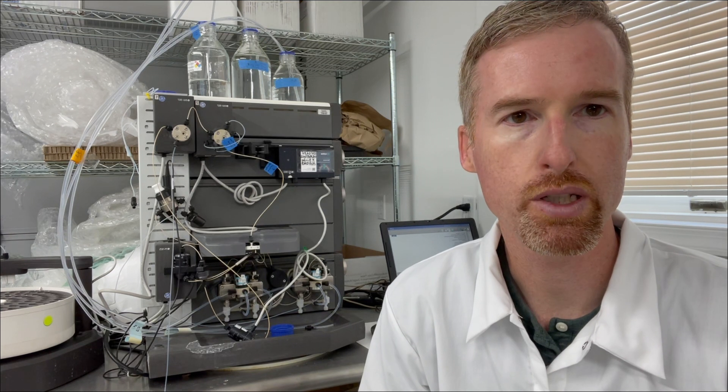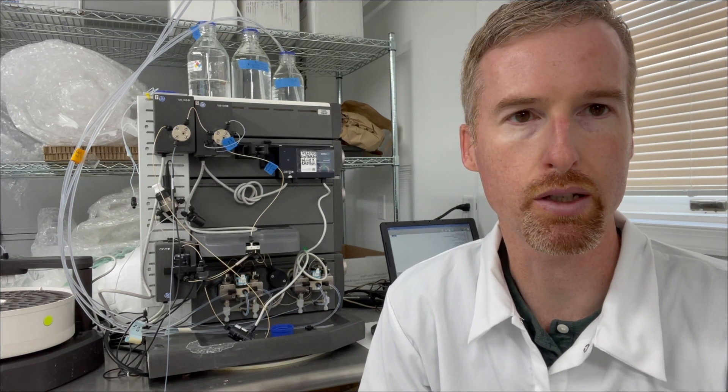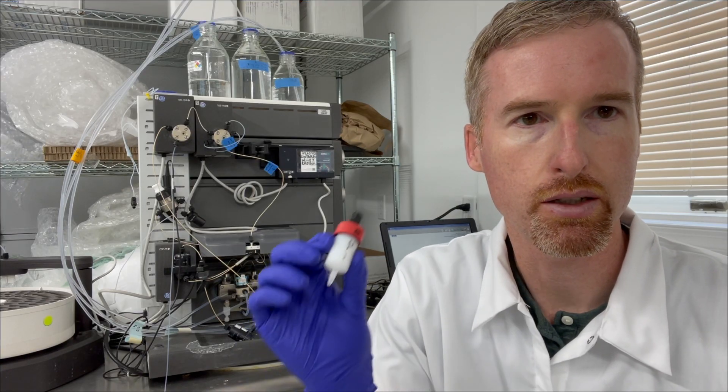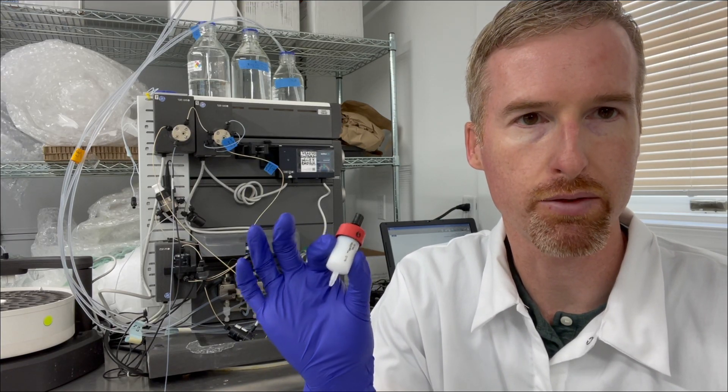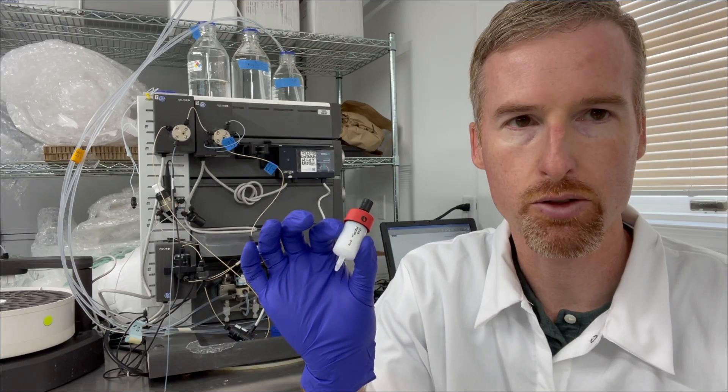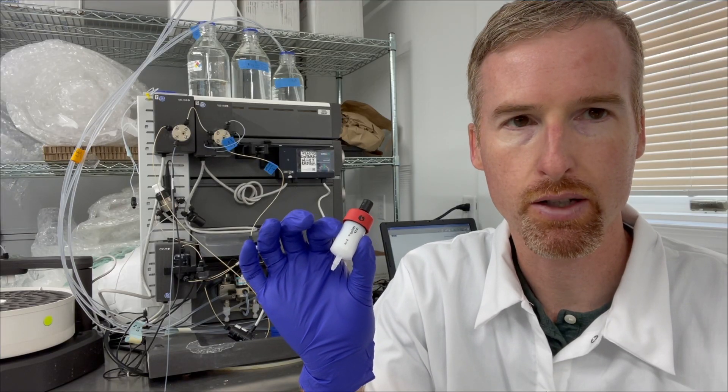Okay, so there's one more thing we need to do with the FPLC before we can load the protein onto the column, and that is equilibrate the column with buffer A. This is a HiTrap Q FF column.